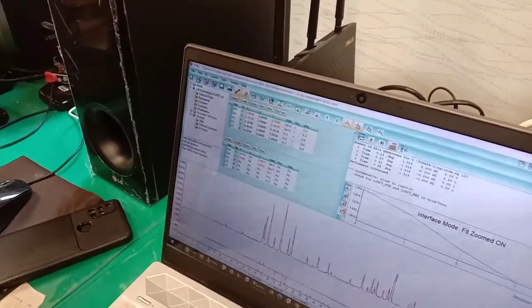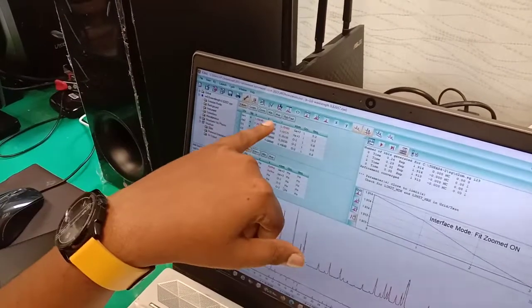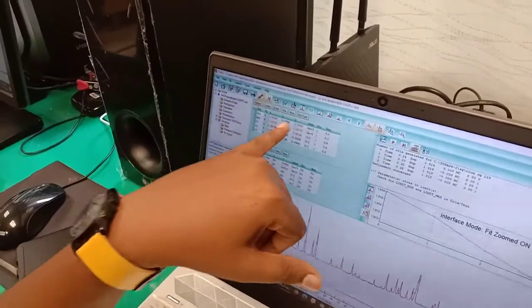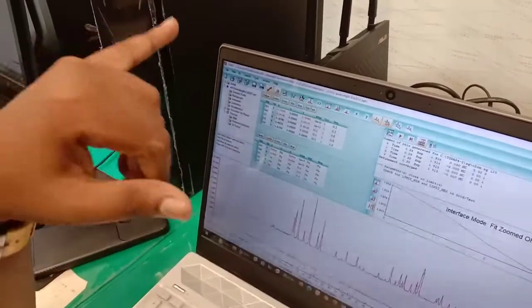So here, why are we not refining the Y positions? The Y position is 0. 0 is some kind of special position in crystallography. You should not do it. 0, 0.25, 0.5, 0.75, 1. Those are very special positions. We should not disturb them.